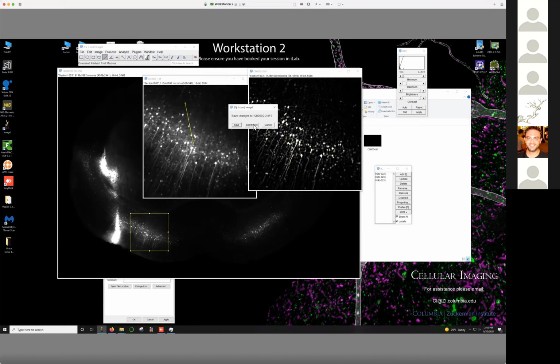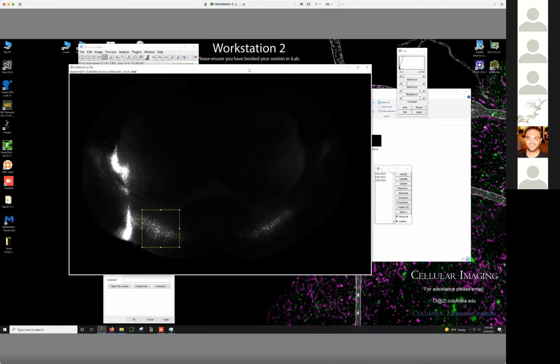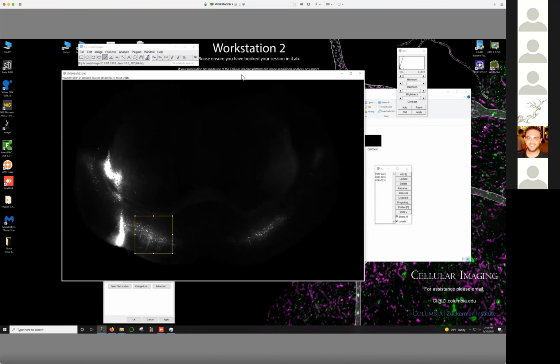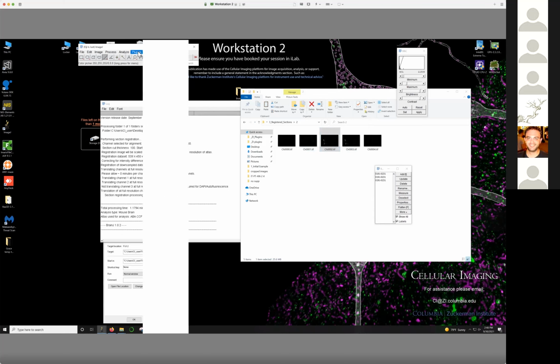So this is where I can show you how to use Ilastik. Actually, I'll show you how to generate the data. If you're going to use Ilastik for training for cell segmentation and axon dendrite segmentation, you don't want to use these files as they are, because in the pipeline we're applying that background subtraction. You could open these images up, do the background subtraction, and then save them somewhere. But because this is a really common thing, there's a step in BrainJ to save you that trouble.